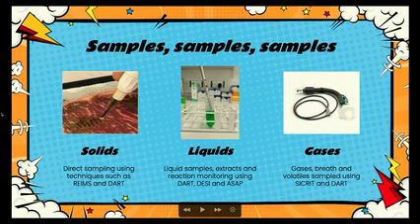you can either introduce the sample still in a liquid form. DESI is very good, desorption electrospray ionization. You can spot samples on there. People might be more familiar with DESI for doing imaging applications where you take a tissue sample, but you can also plate up multiple extracts on a plate and analyze those one after the other in sequence.